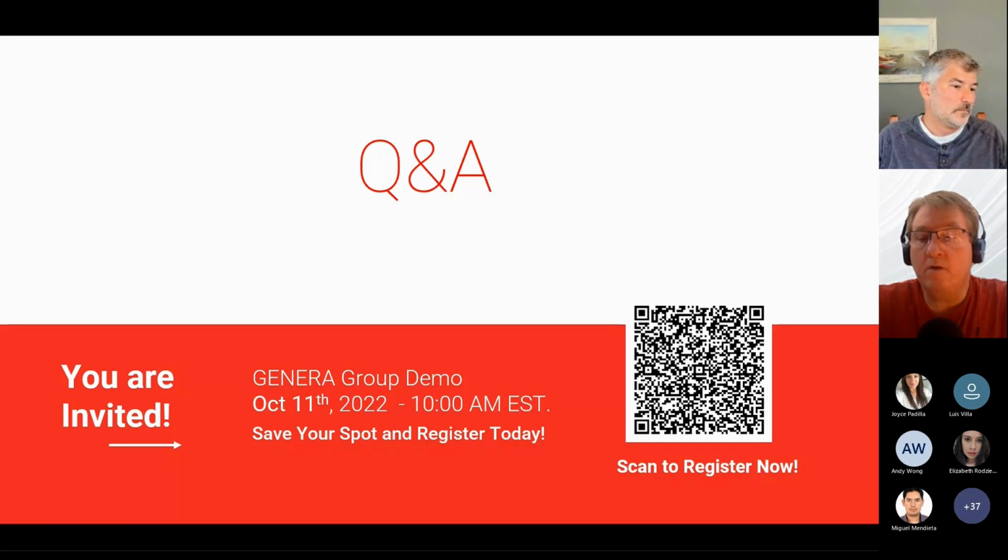Okay. We have another one here from a gentleman named Luis. What are some of the most common mistakes startups make when selecting a LIMS? Perhaps overlooked or just simple naive mistakes?